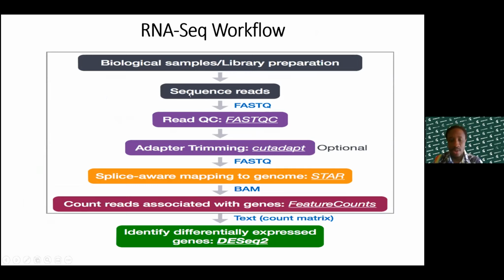After sequencing, this generates millions of short sequences called reads. So we have the sequencing reads, and then the sequencing reads are output as a FASTQ file, right?